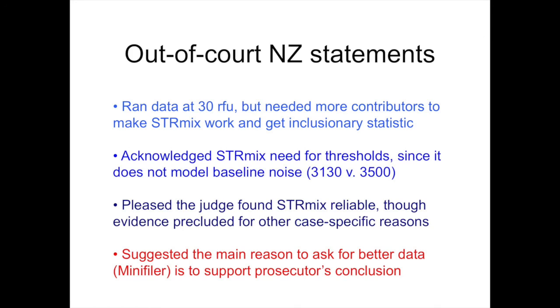But the usual workflow in forensic science for the last 15 years, and perhaps for the next 15 years, is that's not what you do. You pick your data. After you choose it, you decide on the answer. And after you decide on the answer, you take the data that you chose along with the person who you've made the decision on, and then you run a confirmatory program. So it's clear from that worldview that the only reason we'd ask for more data would be to confirm the answer we already had. But that's not our workflow. That's not how we approach the science. We want the data to be determining what the answer is.